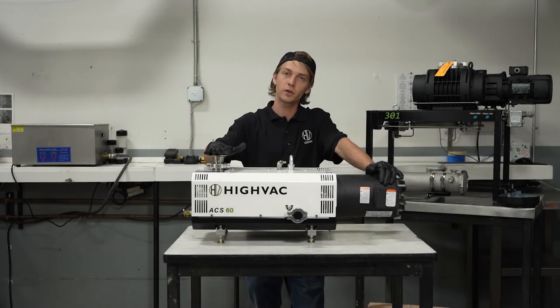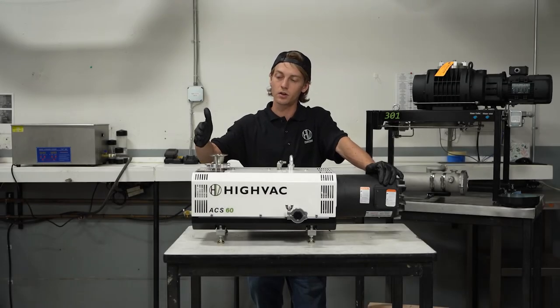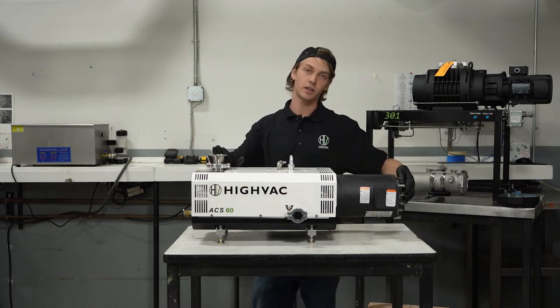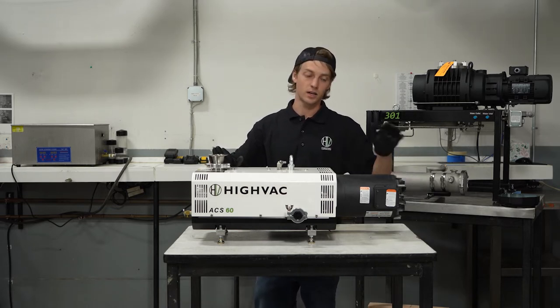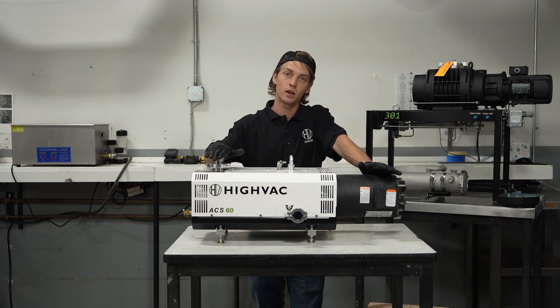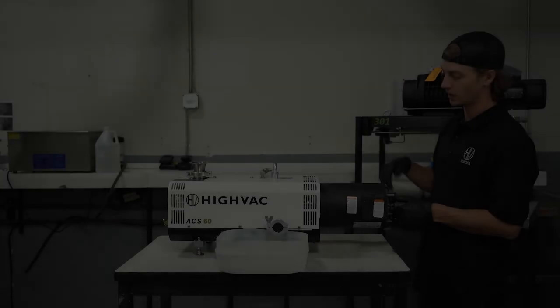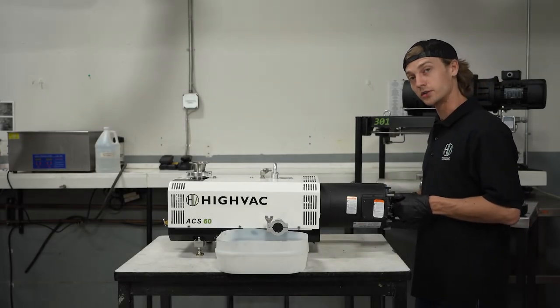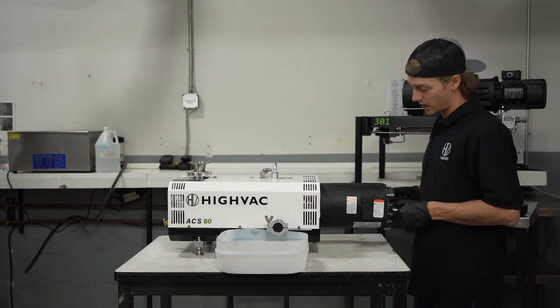Once you've completely filled your pump with solvent, you're going to want to wait at least an hour before you begin to attempt to manipulate it. Sometimes, depending on the severity of the seizure, it may require multiple hours or multiple cycles of solvent to actually free it up. We allowed this pump to sit for about an hour.